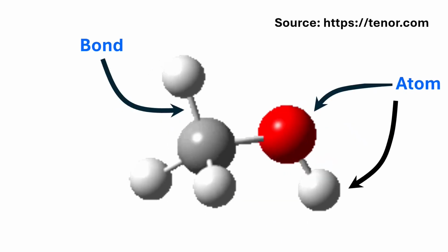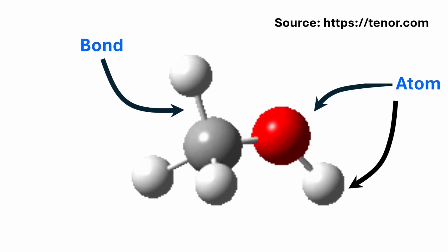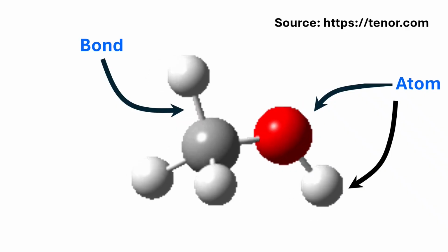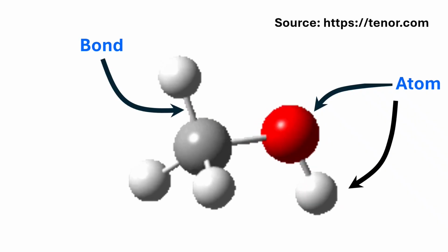In a molecule, chemical bonds are holding atoms together. They are not rigid sticks. They are like springs. They are constantly vibrating at natural frequency, for example stretching, bending, and wagging. I think you understand. I am talking about the vibrations of the molecular bonds between two atoms. I am explaining how FTIR works and what FTIR can solve.